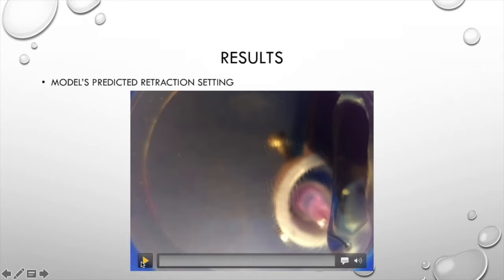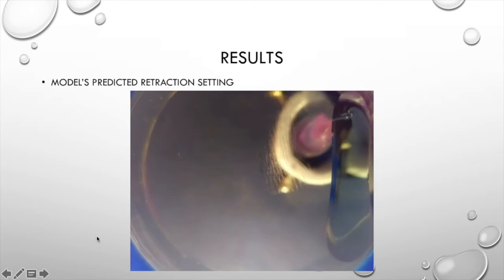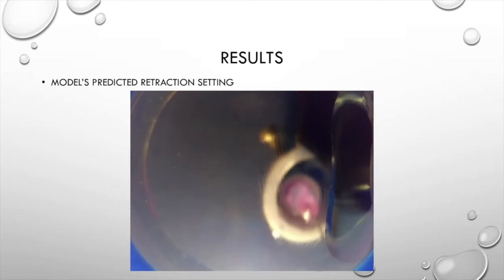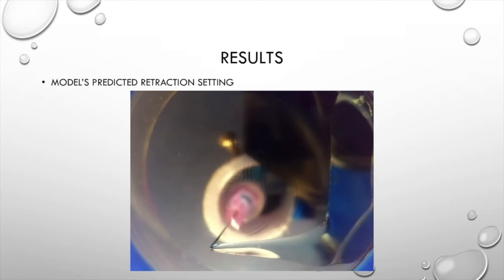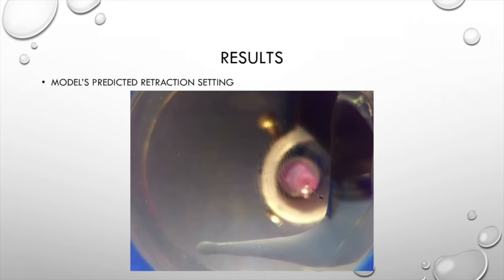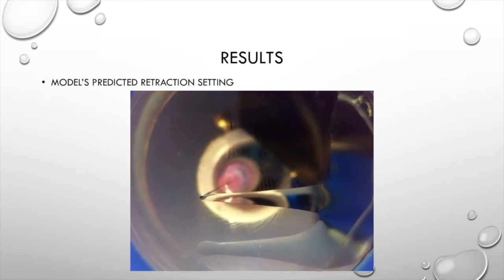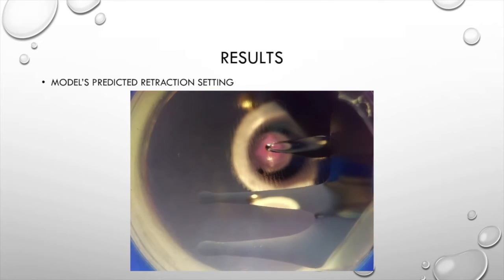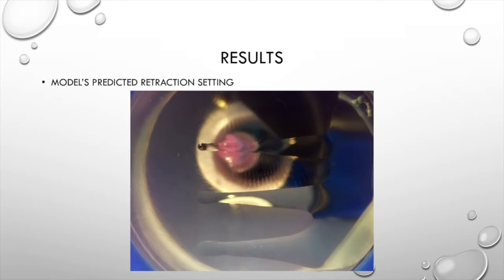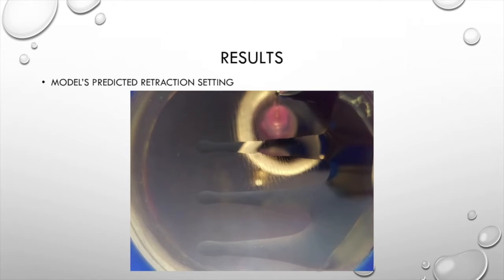So this is when the retraction setting from our model is applied. So here's the end of the priming step. We're going to suck up right here. Okay, there's a clean pass, and suck up right here. So no drips there. You'll also notice that there's a pause right there. And that's 0.2 seconds, like Insu was talking about, after the retraction is all the way set. So we use our time and the amount of retraction calculated by our model.